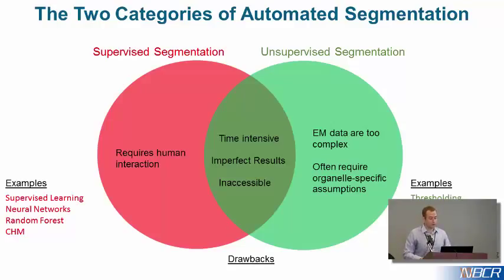So the way that people circumvent this is by installing in the code assumptions specific to certain organelles, like a mitochondrion is only this size, it roughly has this sort of an outline. But as you saw from the images I showed you before, a lot of those assumptions aren't always valid because we have highly branched mitochondria, we have long ones, we have short ones. So it's very difficult to just impose a set of universal rules for this type of process.